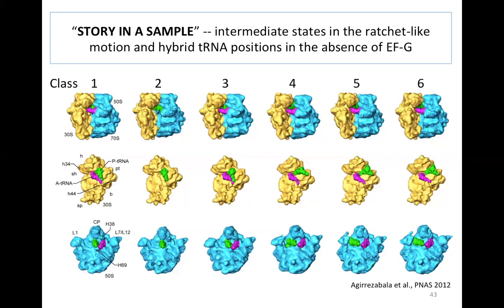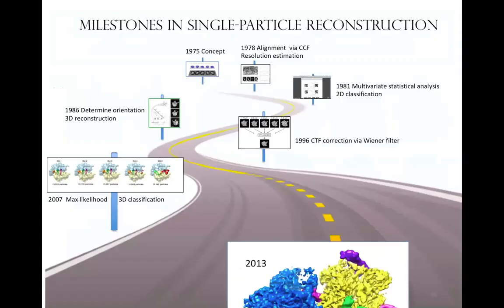And this is particularly interesting when you have a molecular machine that exists in many different conformations and ligand binding states. So you can make an experiment. You do not have to actually introduce conformational changes by some kind of chemical intervention. You can simply look at the entire conformation spectrum all at once. It was very exciting to me that we were able to do this.